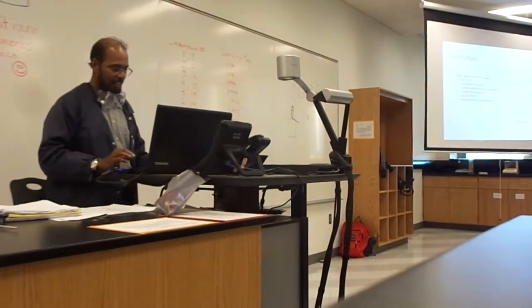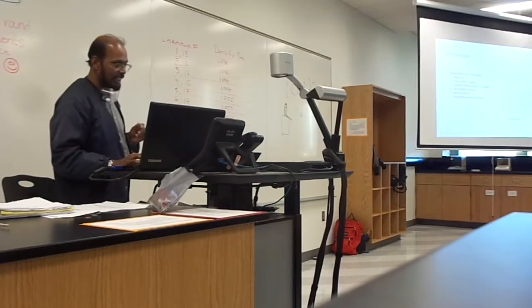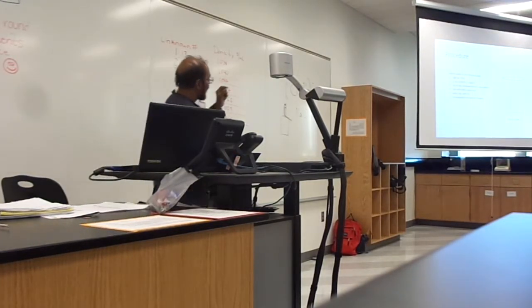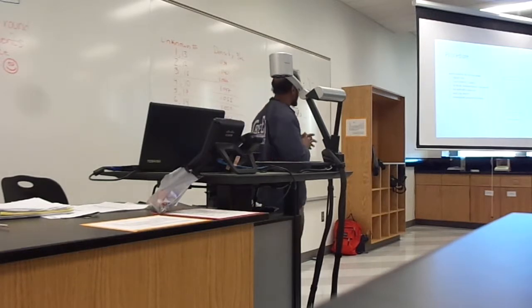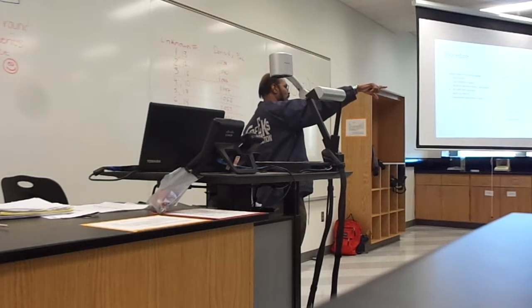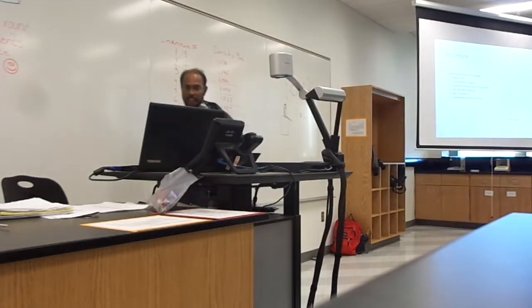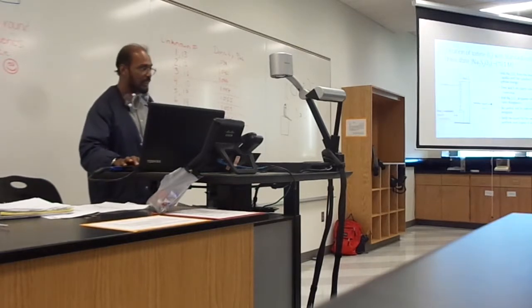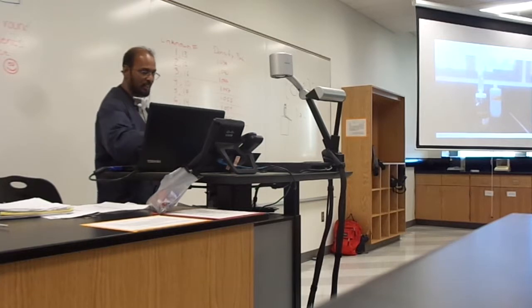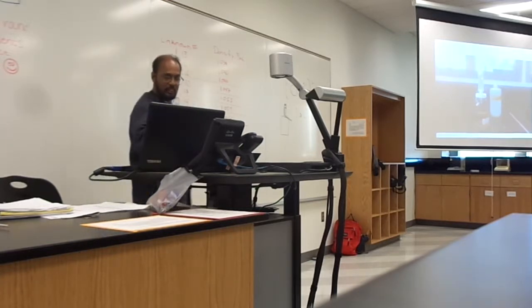And then make a 250 milliliter beaker ready and add 100 milliliters of water, and then you need to add potassium iodide. Potassium iodide is over there in the brown squirt bottle. You can see one of the brown squirt bottles like this. This is hydrochloric acid, but it's similar to this, and you use that white one.